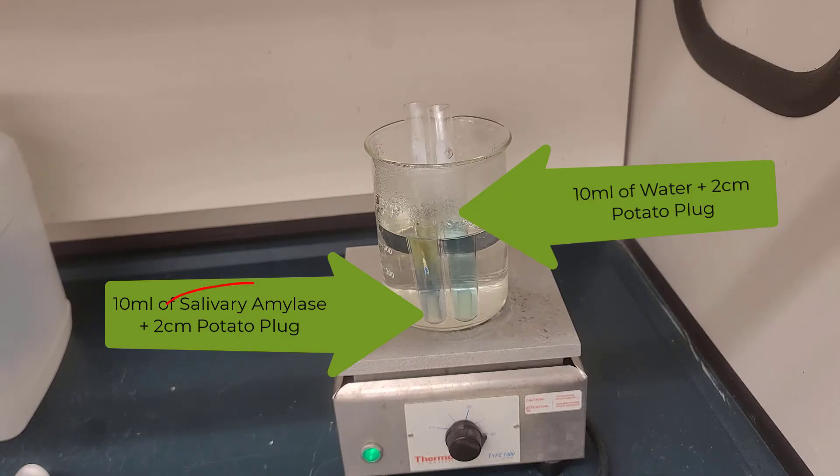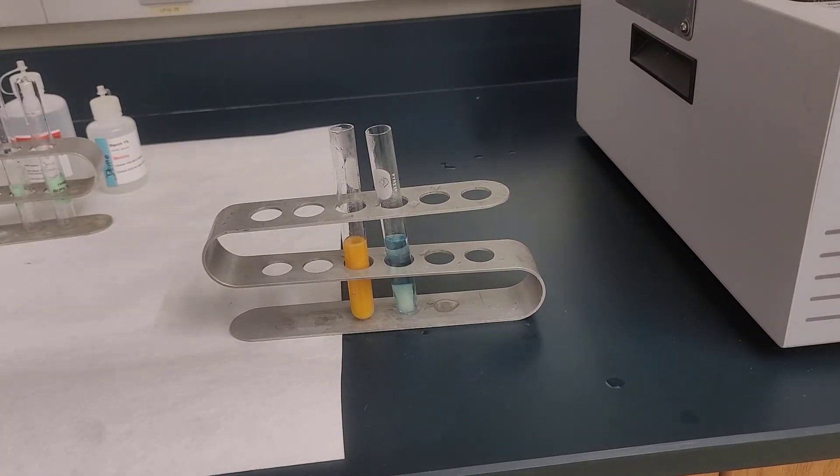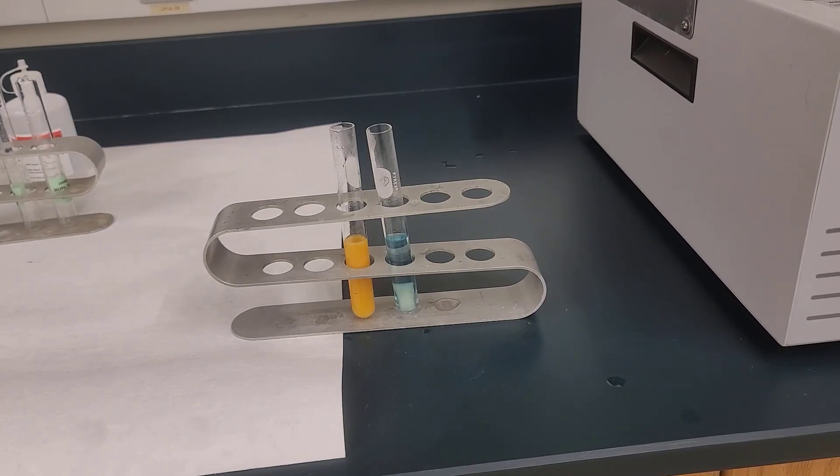And what you see is in just several minutes or so, the tube that has the amylase in it — tube two — starts to turn a sort of dark color first, and then sort of a red, and often will end somewhere between a bright red, bright orange, or yellow color, depending on your interpretation of color. But you can see it's quite different than tube one with just the deionized water and the potato plug, which remains blue at the end of the experiment.